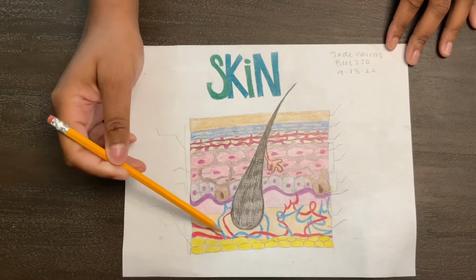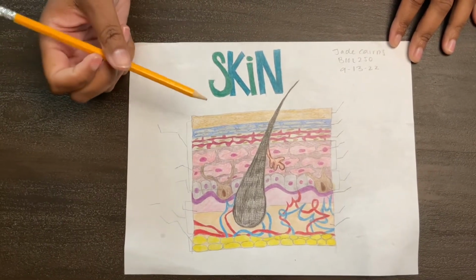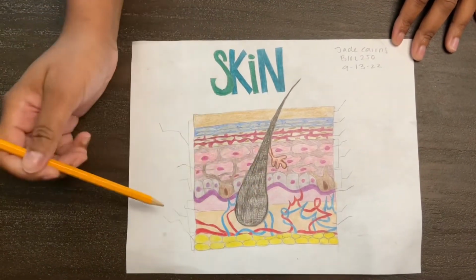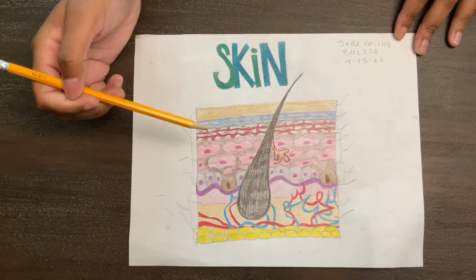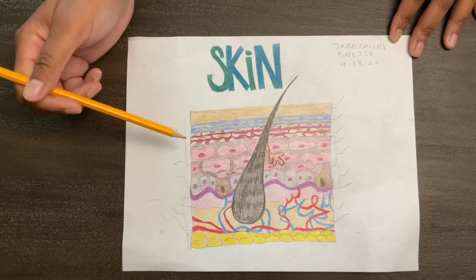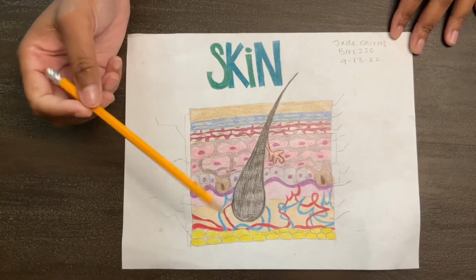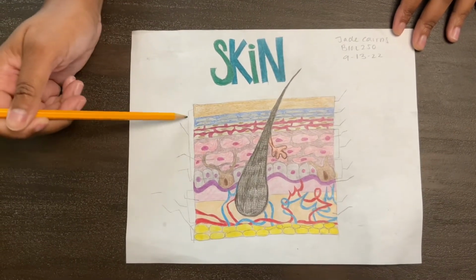The blood vessels are right here. The dermis is this region right here. The epidermis, which is the top layer of the skin, the epithelial tissue, is right up here, these layers.